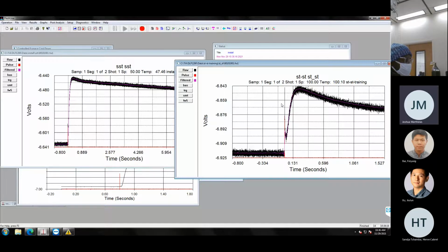So, what are the reasons this happened? For example, because of sample preparation, because of sample material. Yes, sample preparation is usually the number one cause. So for sample prep, your samples need to be opaque, right?